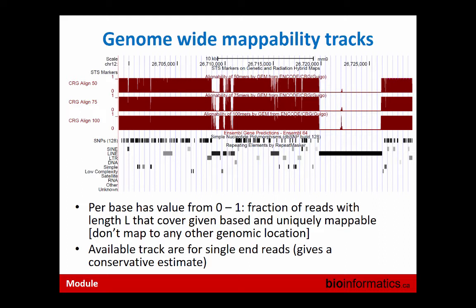This is available for you from the UCSC browser. That's a track already pre-computed. But what if your genome is not on the browser? You can load it, actually. Maybe we can talk later about this, but you can load anything. You can use human to fake it, or you can do whatever you like.